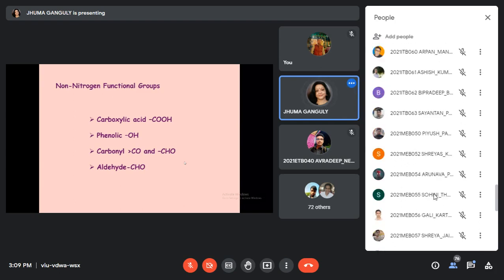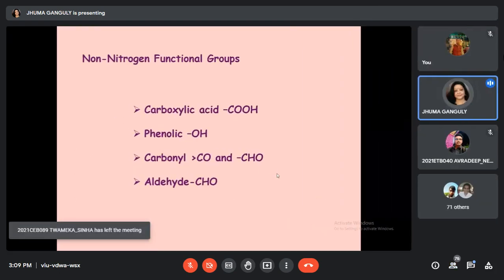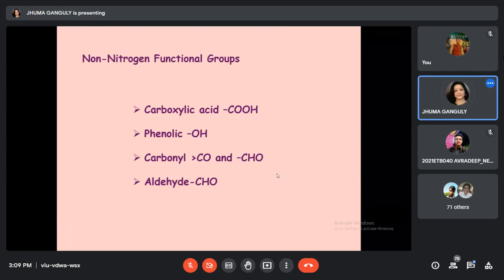Suppose in one day we use the lab just for opening and seeing the compounds, choosing the compounds, then all students perform the functional group tests. For carboxylic acid, you would test different substrates, but here there is no scope.